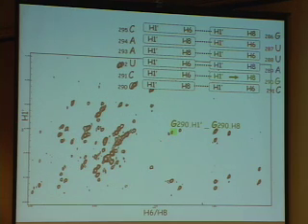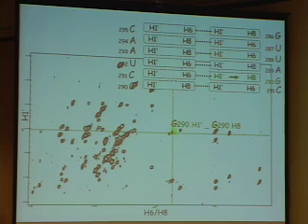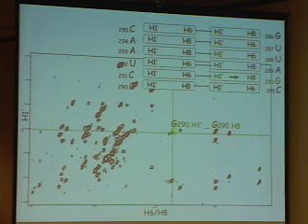So what this tells us is that on the same horizontal line, we know all cross-peaks that will show an interaction here are associated with the G290 H1 prime. And on the same vertical line, we see that all interactions that occur on the same vertical line show an interaction with the H8 of G290. So by this method, we can make the next step in our secondary structure in assigning the spectrum, which logically would be a vertical step down.